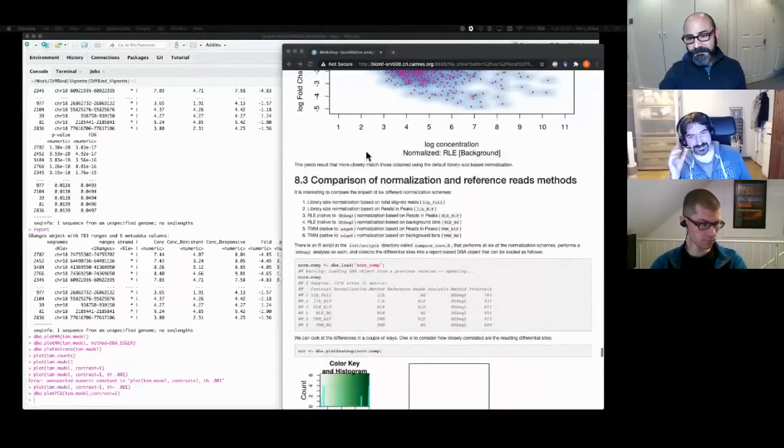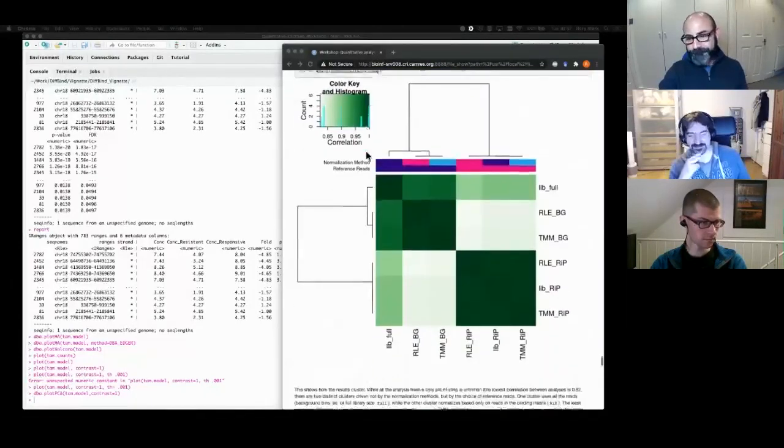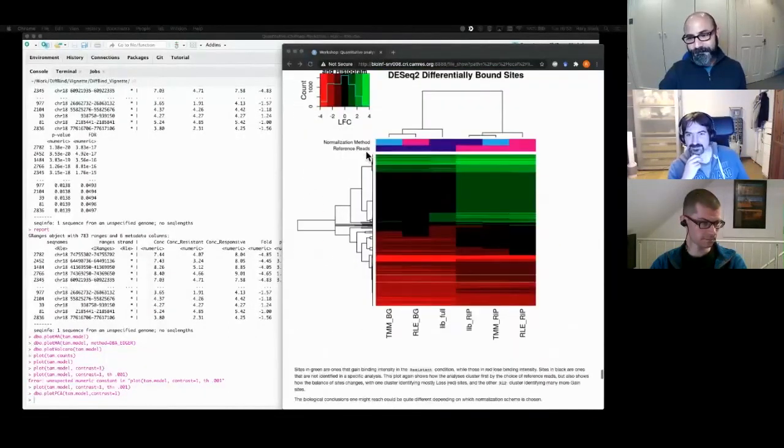If I may, Rory, I have a quick question regarding these spike-ins. There are these indexed ChIP protocols where you basically barcode your fragmented chromatin from different samples and then do a single IP with all the replicates and all the different conditions. Do you have experience with that? Does that work better? I've handled that once, and it was a good experiment. The problem is I personally have an N of 1, but it makes sense, right? Because you're doing it together.